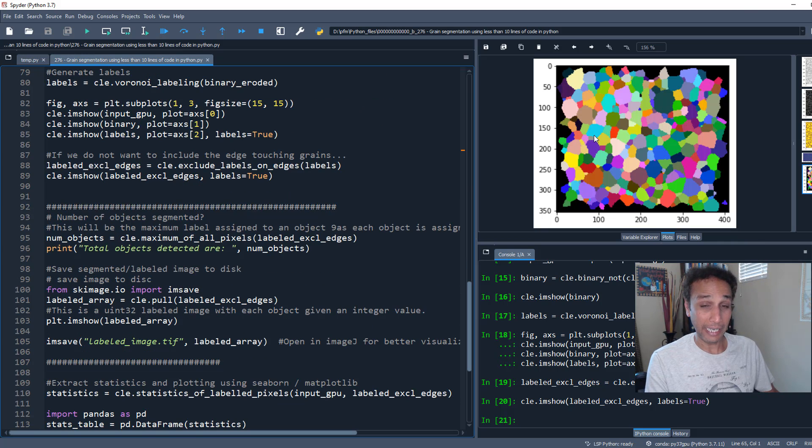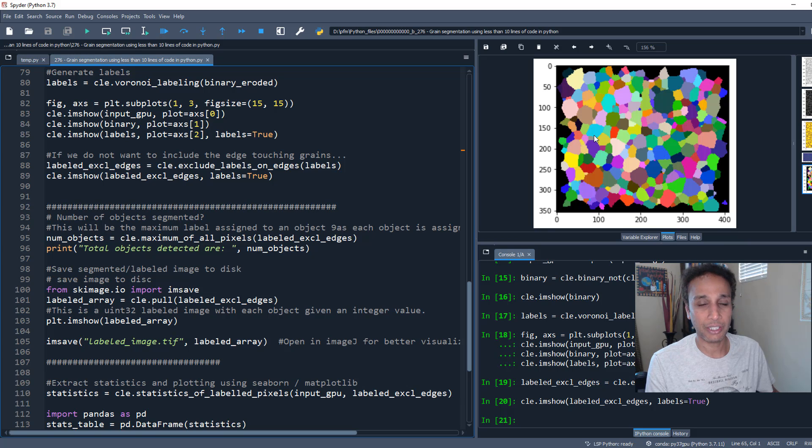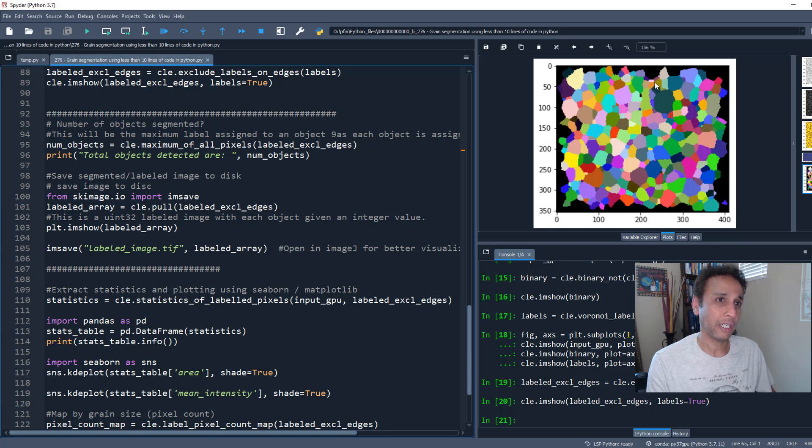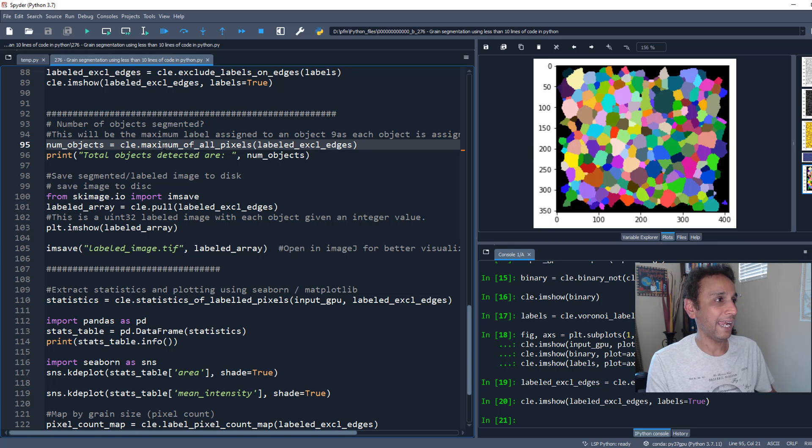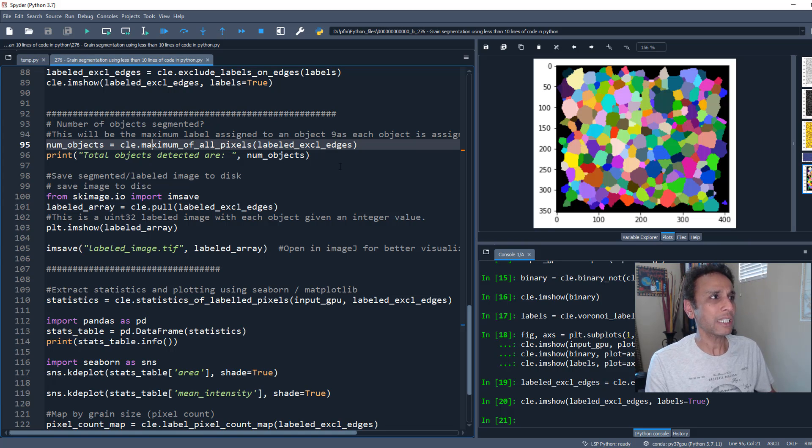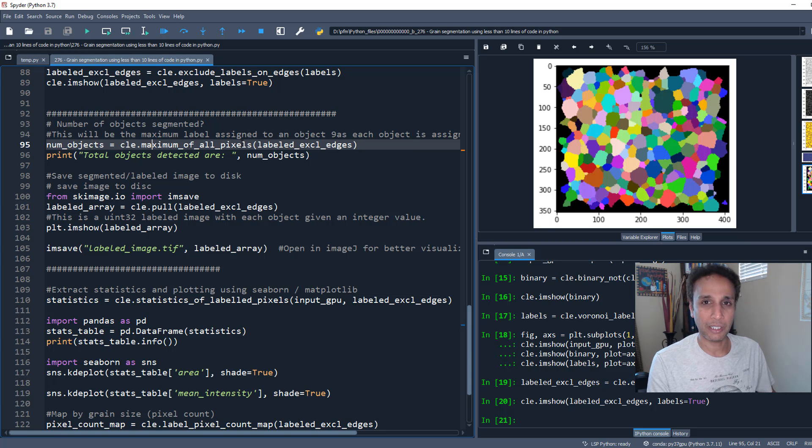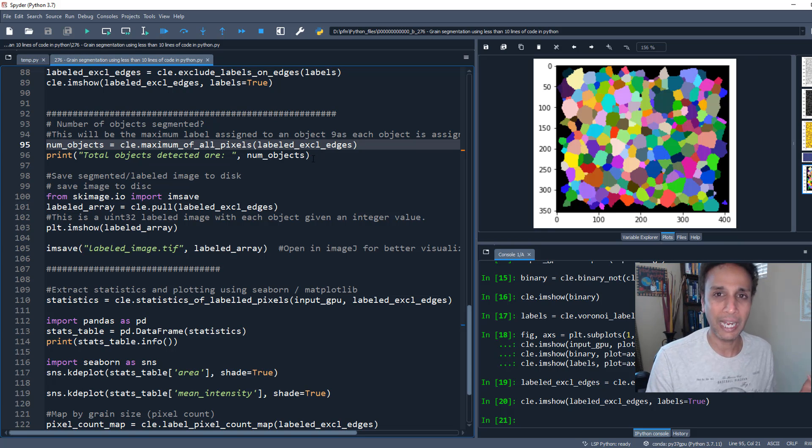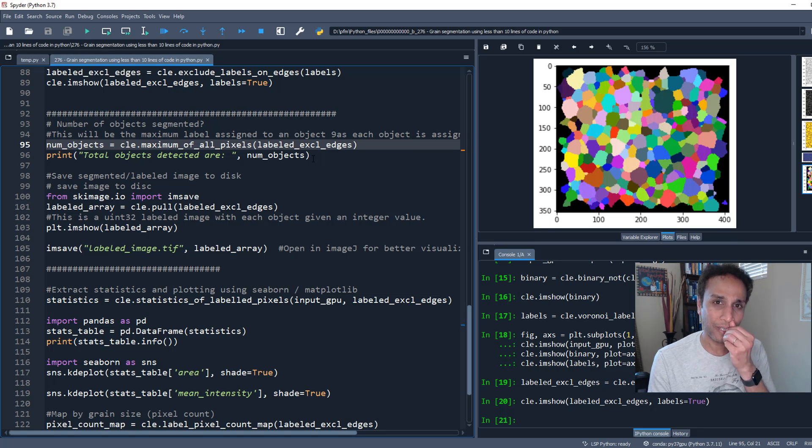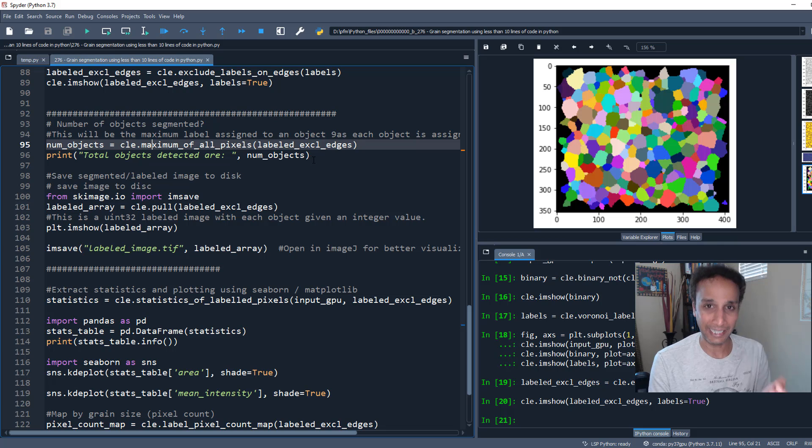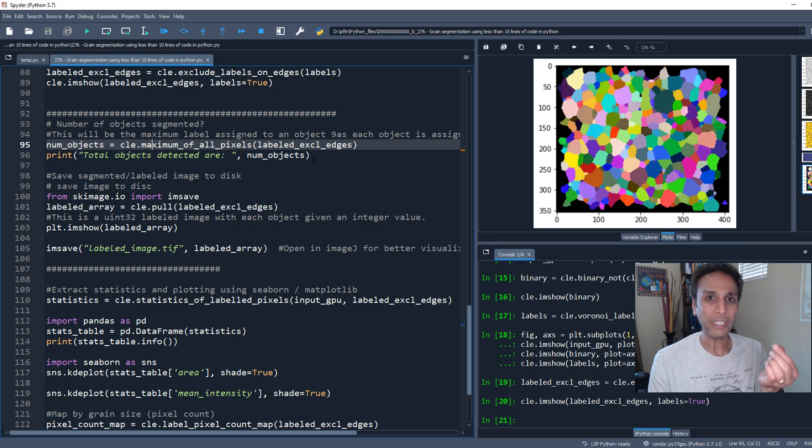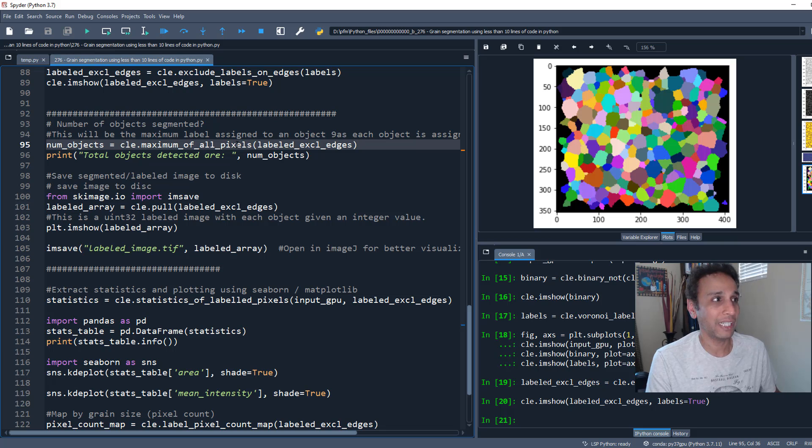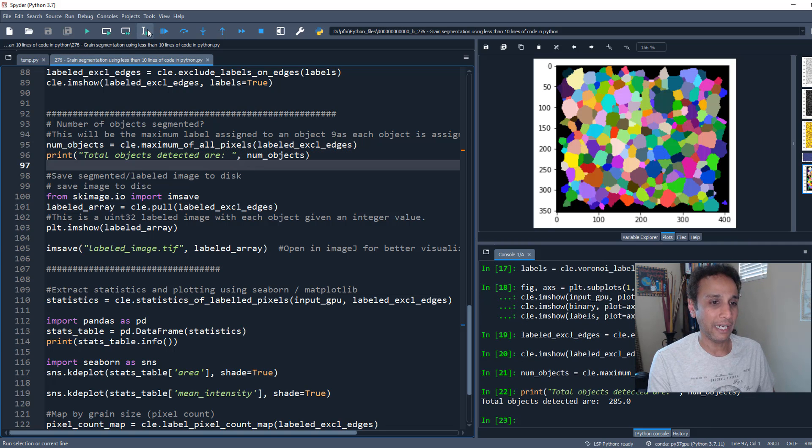We have a labeled image. Now we need to get statistics. First, how many objects do we have - 200, 300? For that, let's use maximum of all pixels. This is a labeled image where every object gets a unique ID - the first object gets an ID of one, the second gets two, three, four. By looking at the maximum of all pixels, I know exactly how many objects we have. We have 285 total objects.